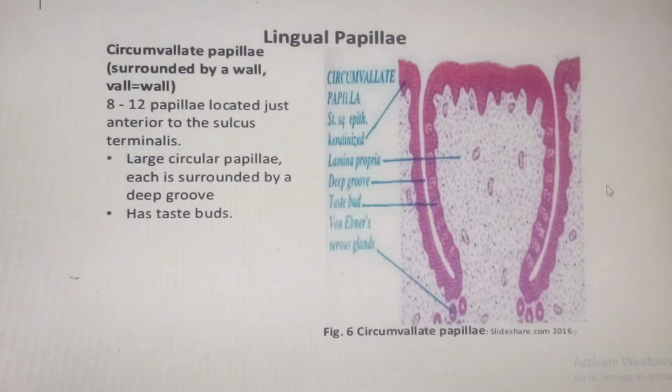Okay, so good. Now we want to review these primary papillae that I'm talking about. The first one I want to talk about is the circumvallate, or simply the vallate papillae. We said that the vallate papillae lie just anterior to the sulcus terminalis, the V-shaped sulcus that we find over there.